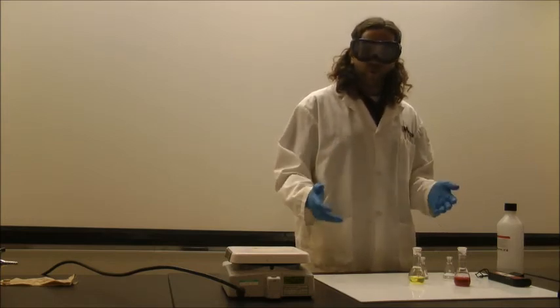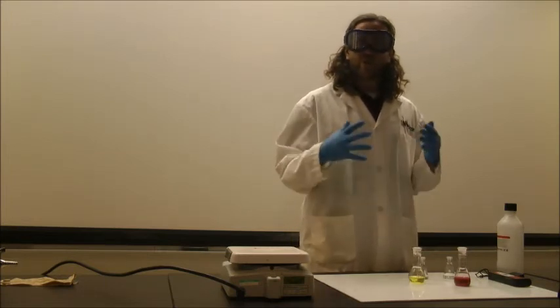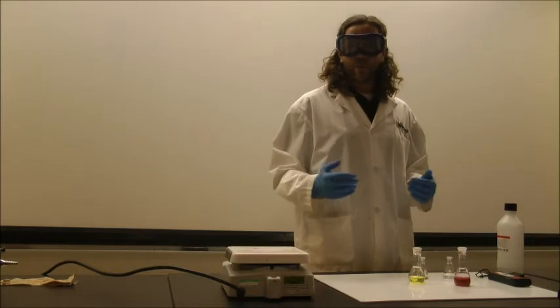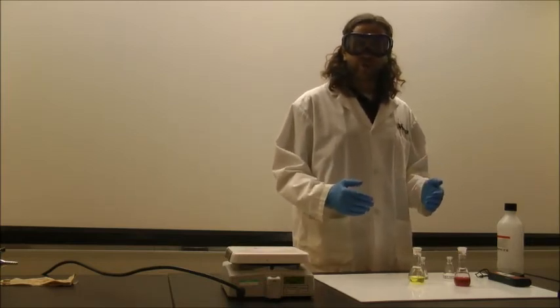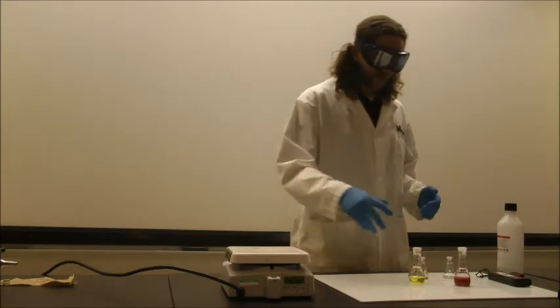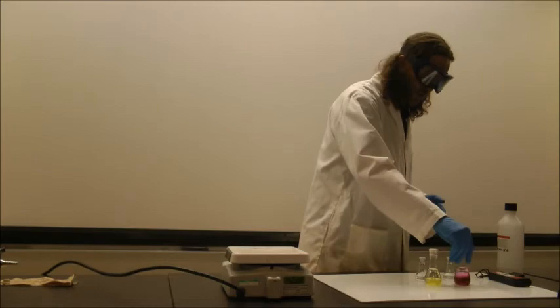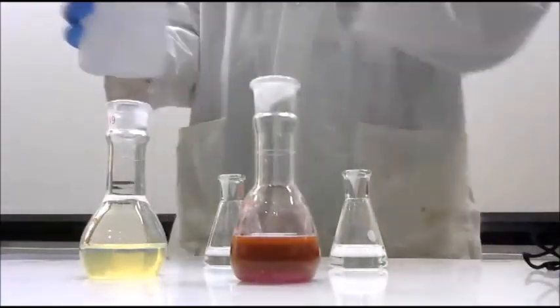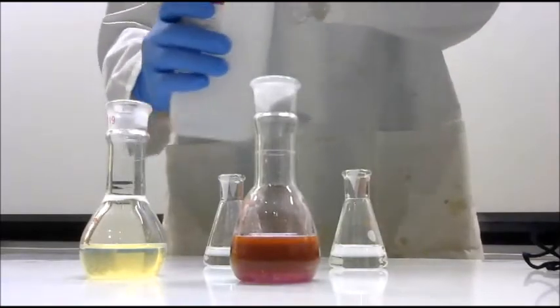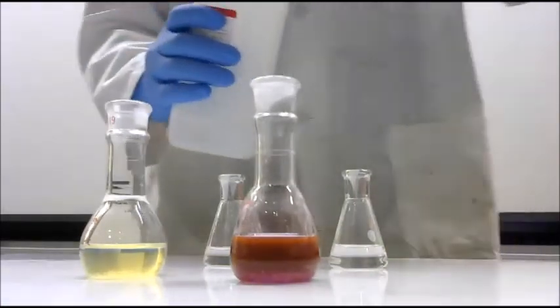So an even cooler thing to do would be to make a mixture that just glows on its own. We call that chemiluminescence. Chemiluminescence is a chemical reaction that causes luminescence, right? This is the reaction that's going on inside glow sticks. What we're going to do is use some very concentrated hydrogen peroxide solution. I've got my gloves on to make sure that I'm keeping my skin safe.